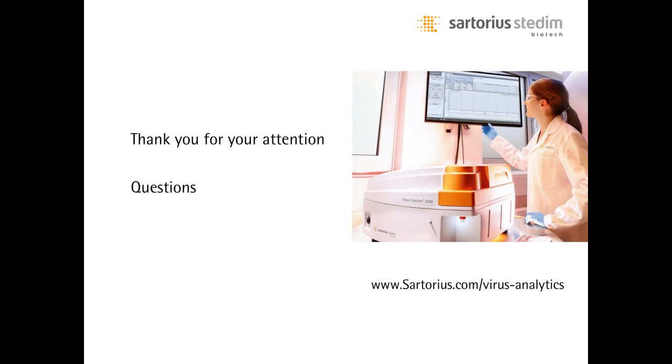Does this method quantify damaged capsids? So with damaged, I'm not sure what exactly you mean. So we currently cannot see the difference between an empty and a full capsid. So you cannot currently distinguish between a capsid that has nucleic acid in it or that does not. Okay.